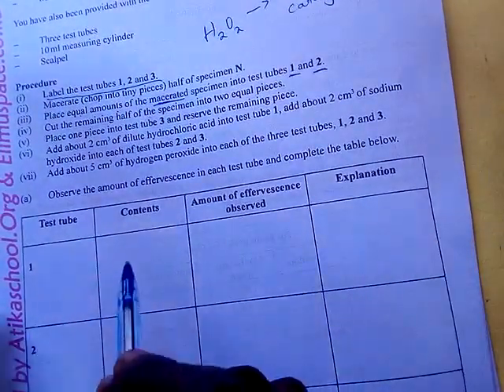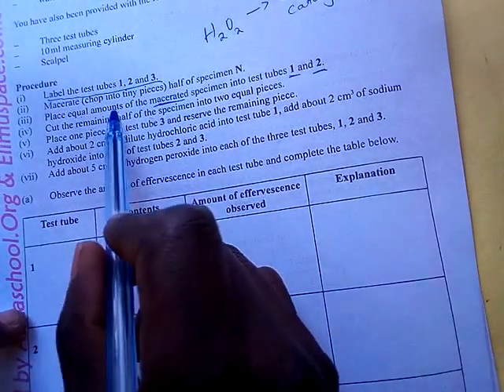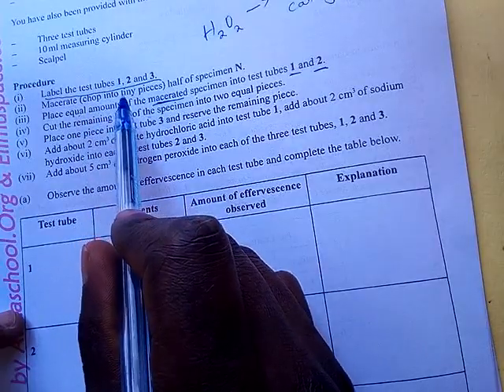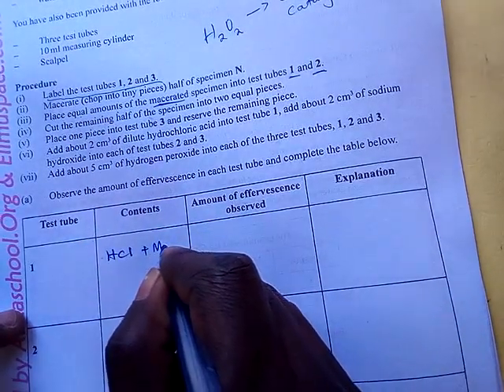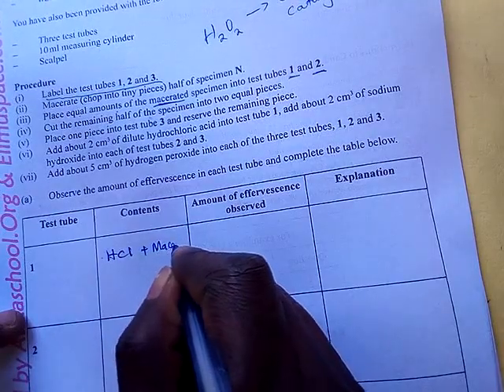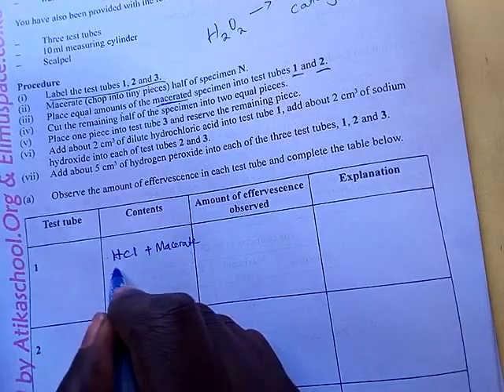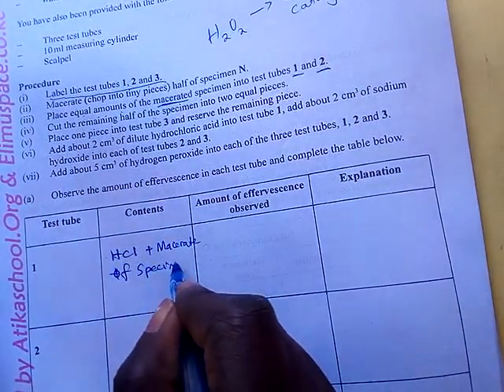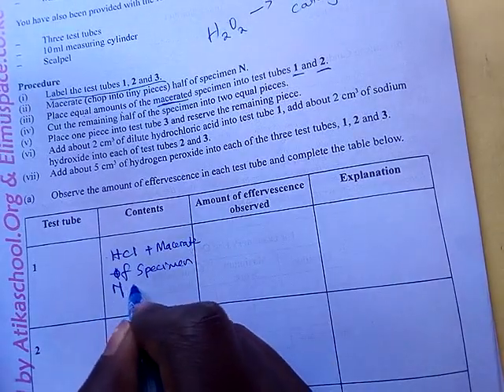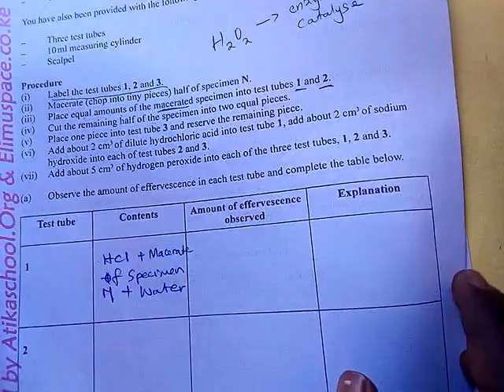So the content in test tube 1 is HCl plus the macerate of specimen N that you cut into small pieces, plus water. What is your observation?